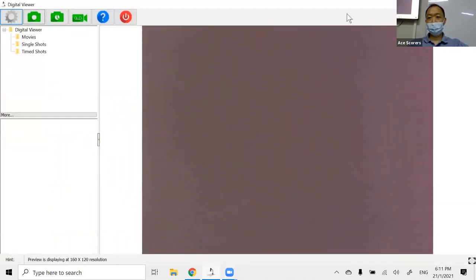So I have here a digital microscope. You can see some stuff on the screen, right? Does it look fuzzy? Yes, of course it looks fuzzy. It's a cell, isn't it? No, it's not a cell. What I have here is a digital microscope. As you can see, it is a device that can help us to see small things.